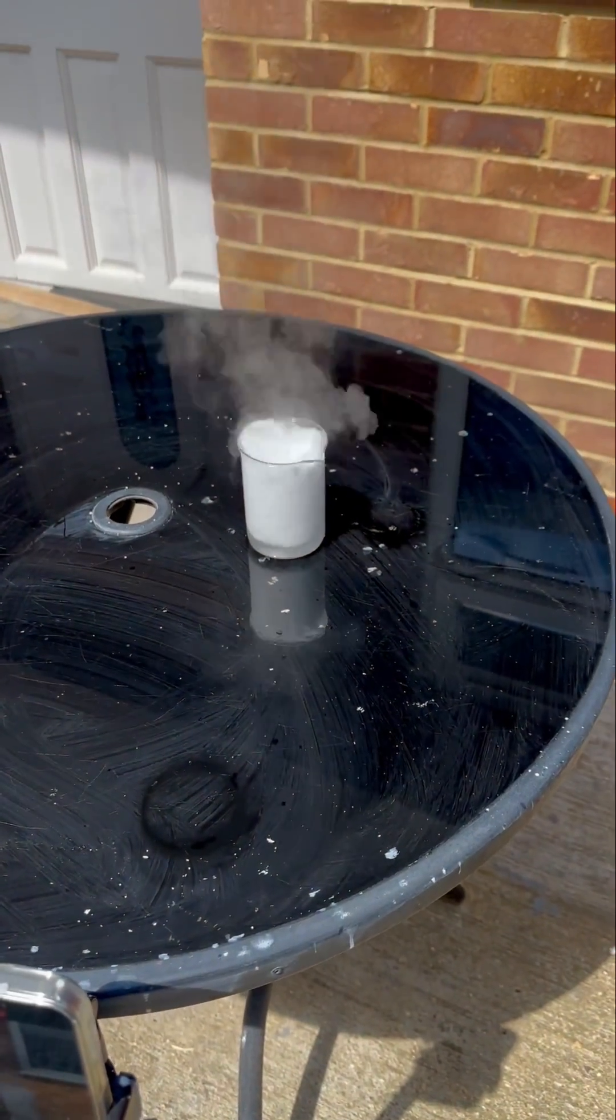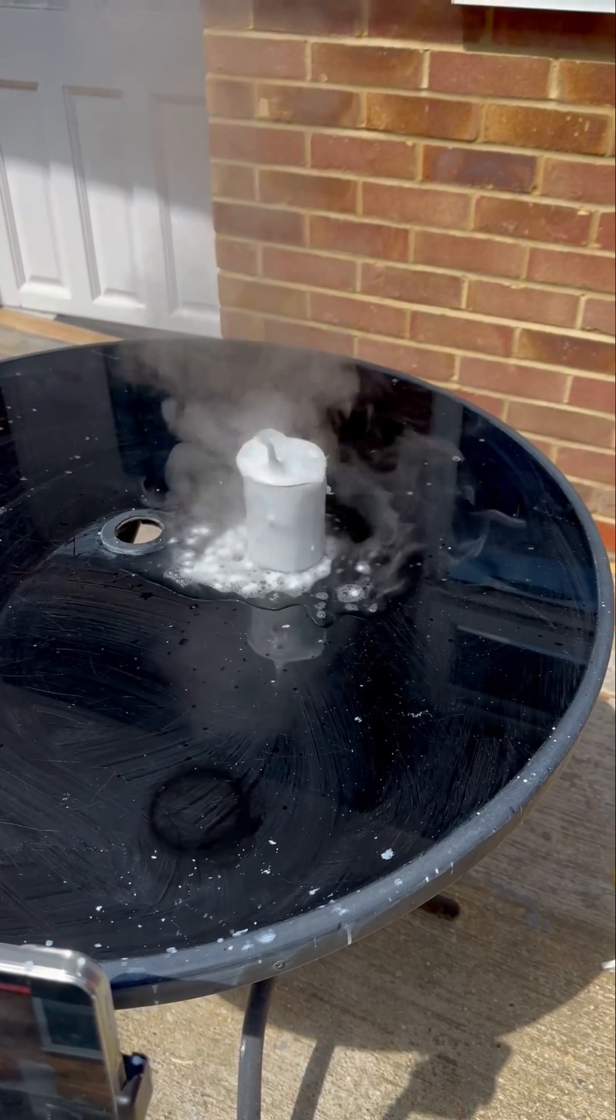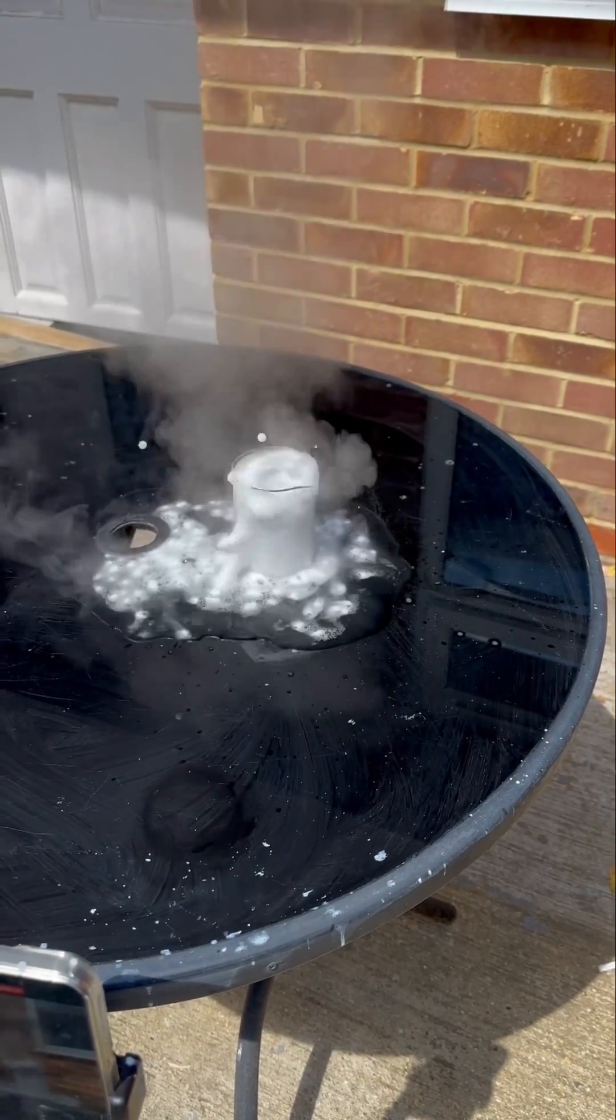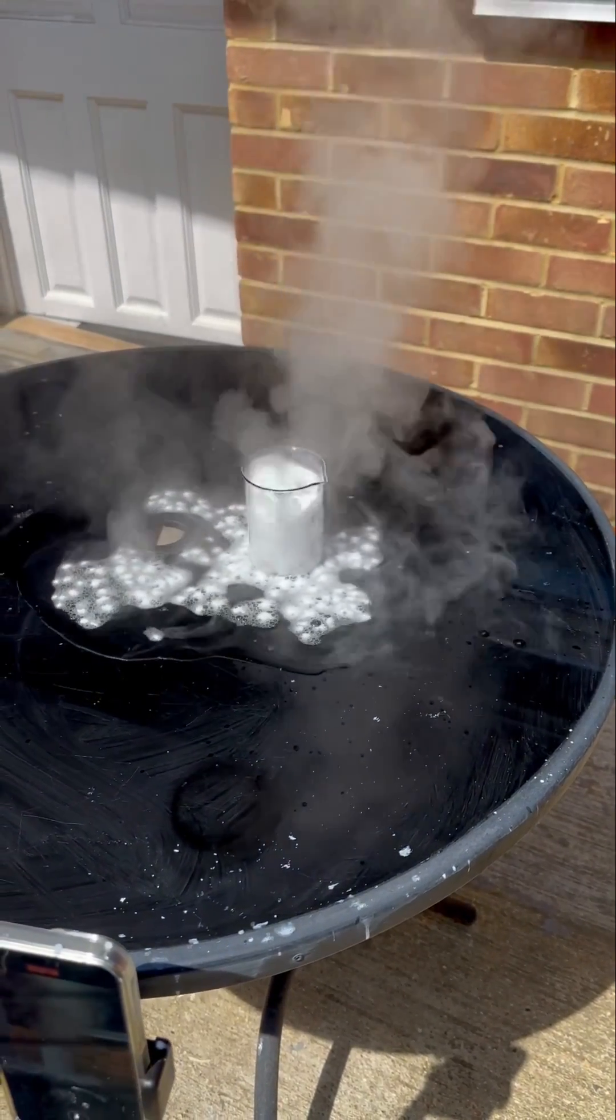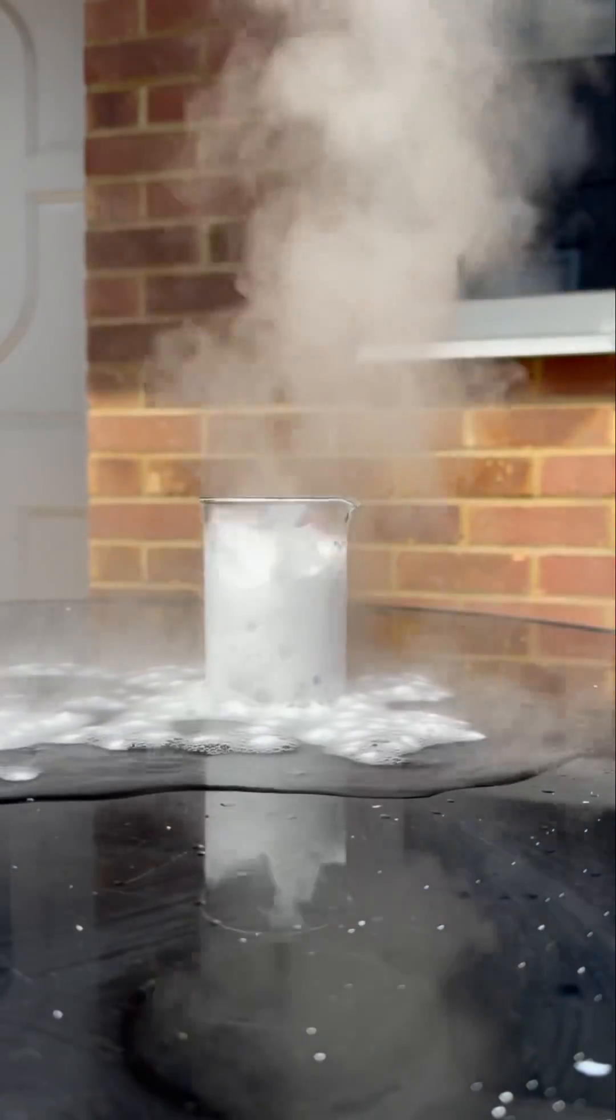So obviously whenever you put a metal into an acid, it always makes a salt plus hydrogen gas. So obviously because it's hydrochloric acid, the calcium combined with the chlorine and it formed calcium chloride - that's the salt fam.